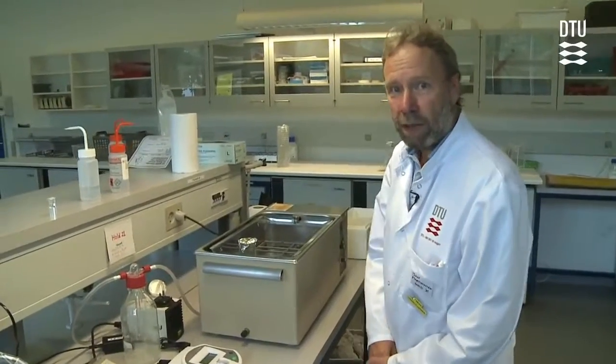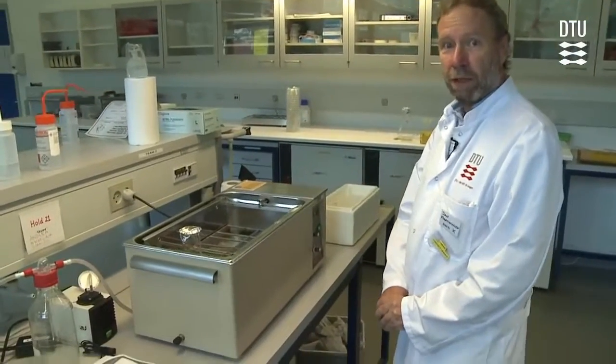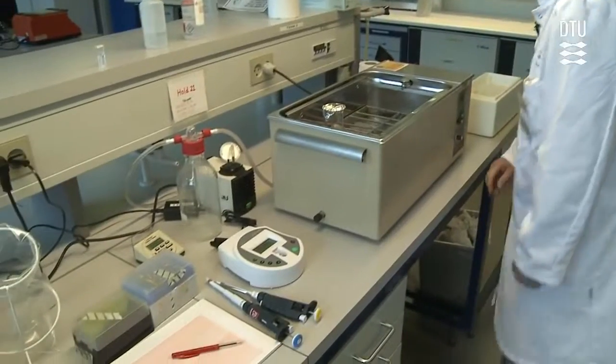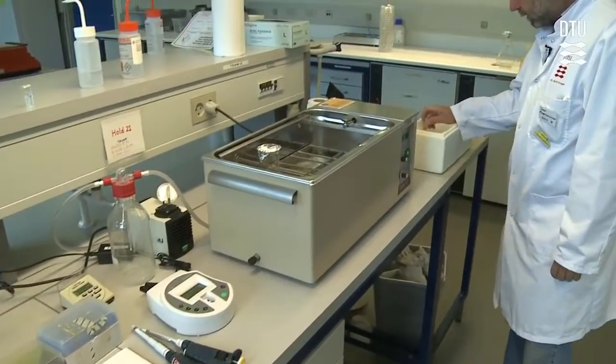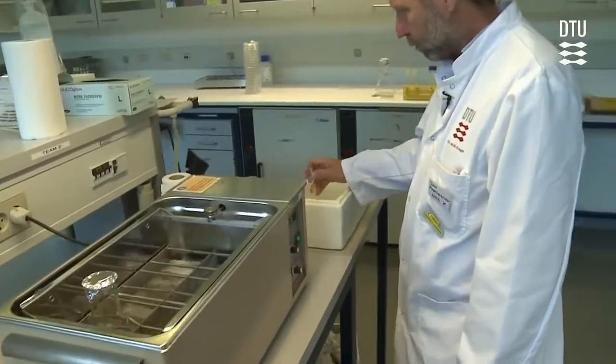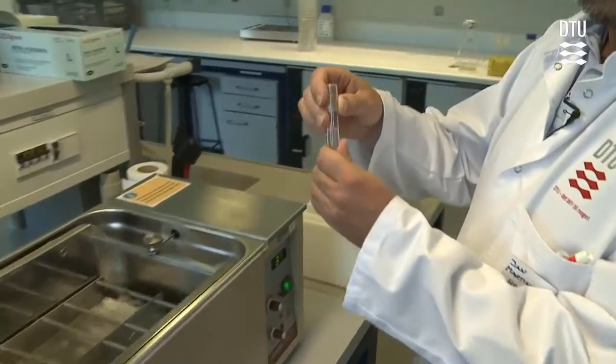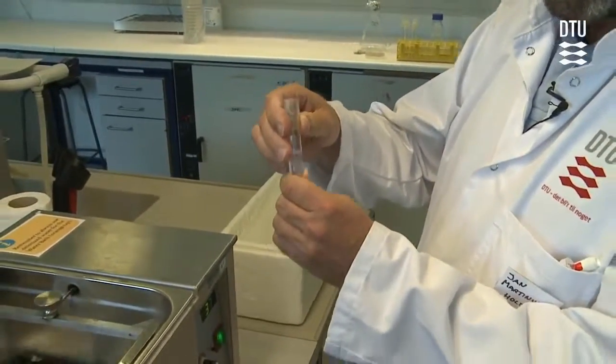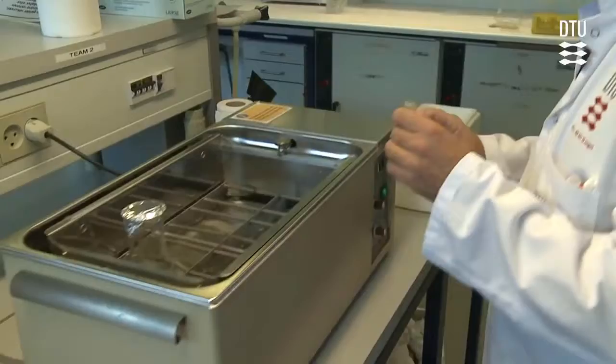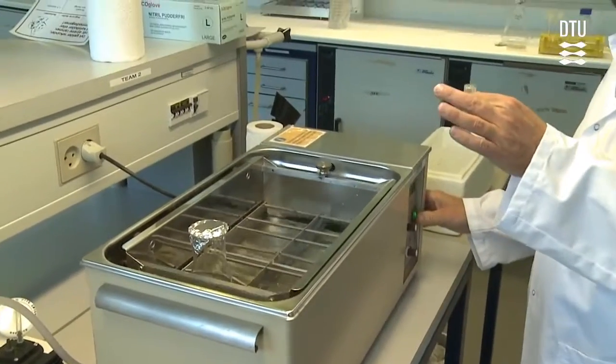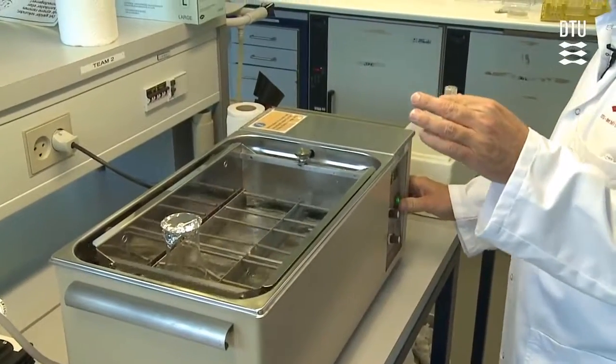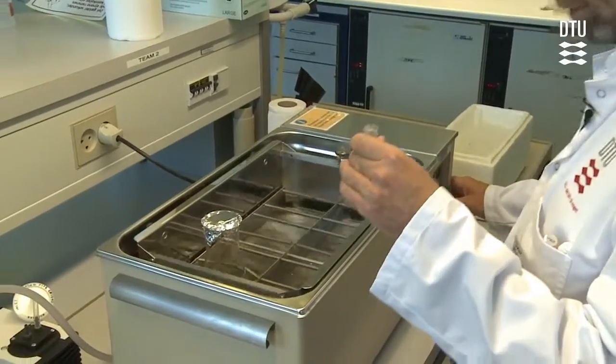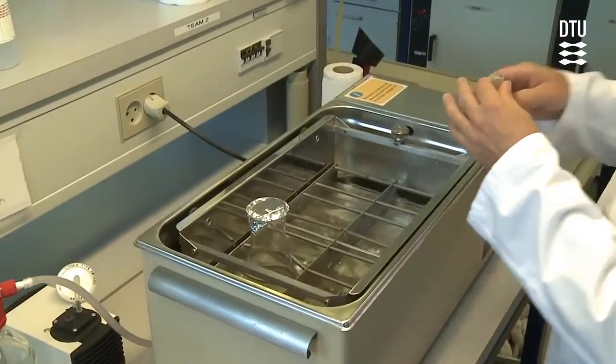Now it's time to start the experiment where we want to enrich the medium for arginine requiring mutants. On ice we have an exponentially growing culture that was growing in a medium without arginine. We add the entire content of the tube into the medium in the water bath.